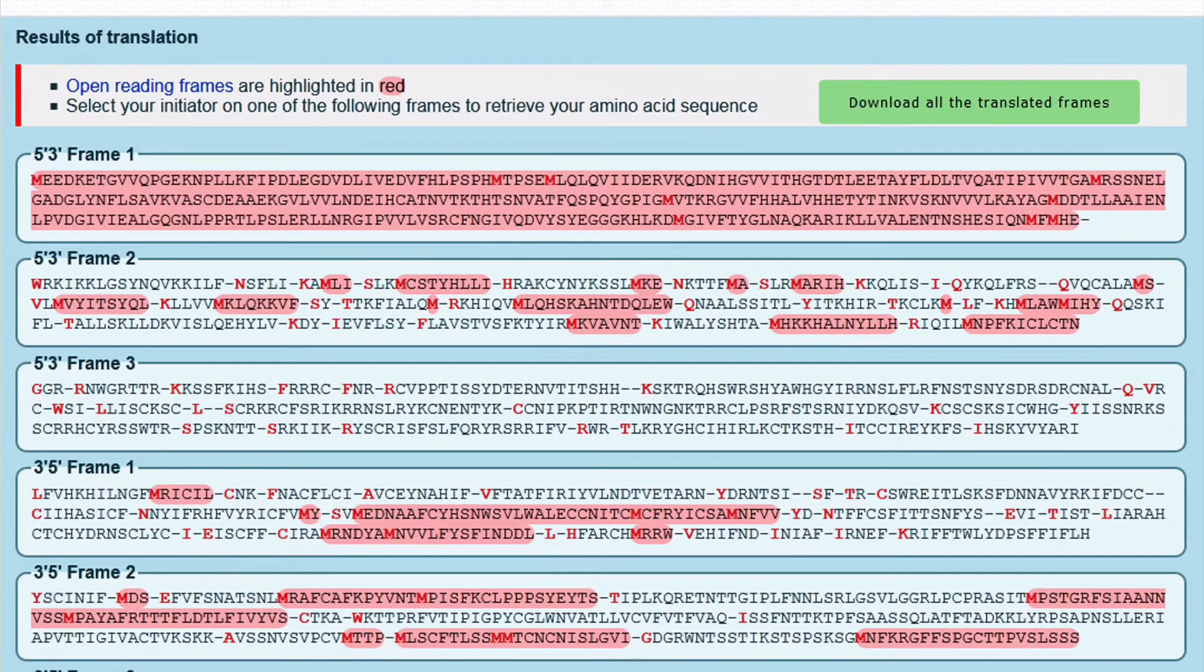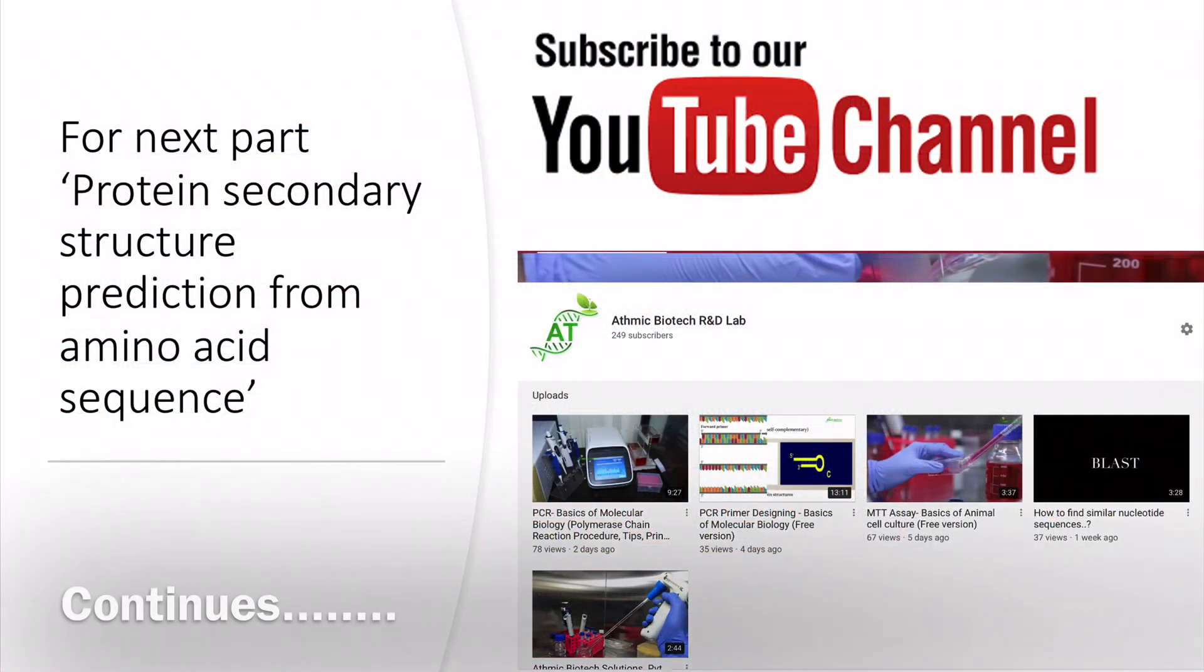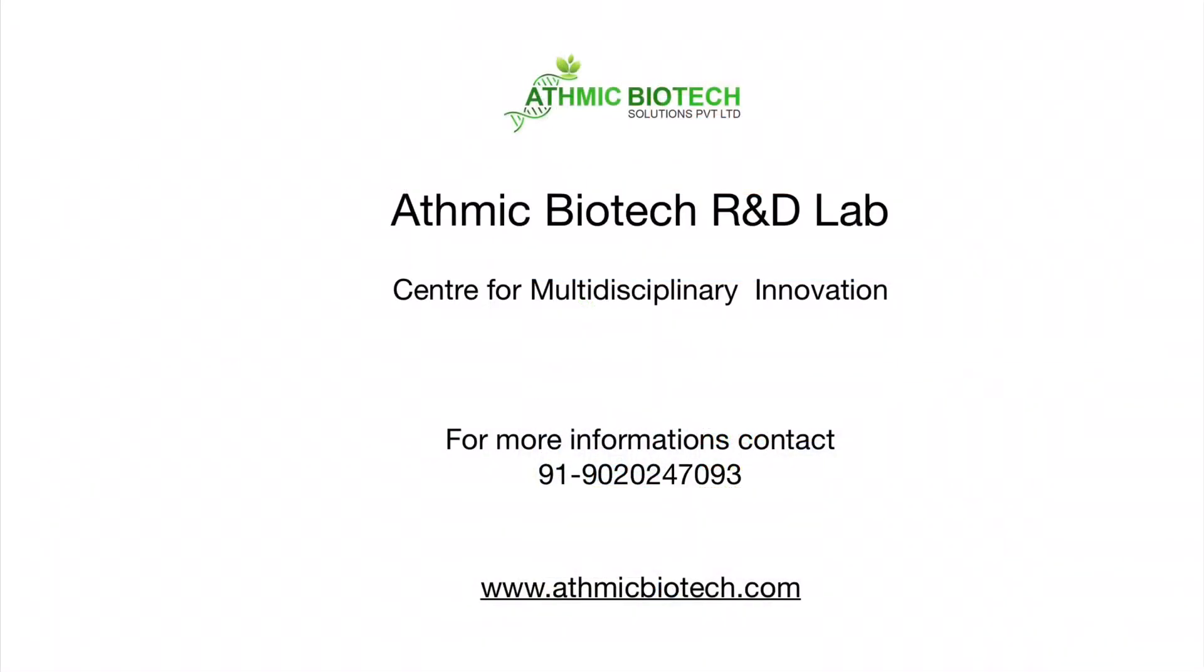Your amino acid sequence is now ready for further analysis.